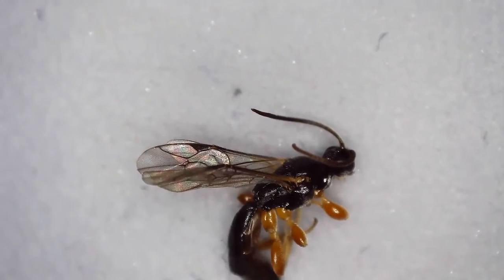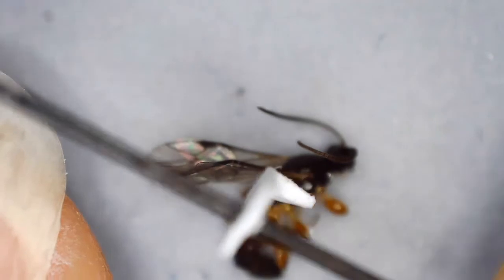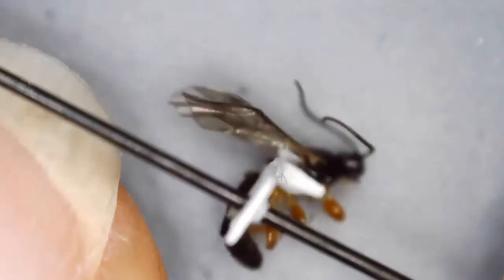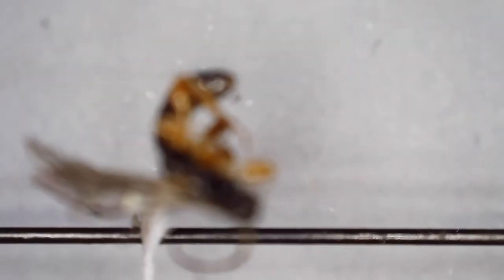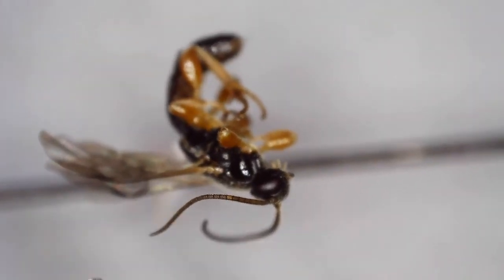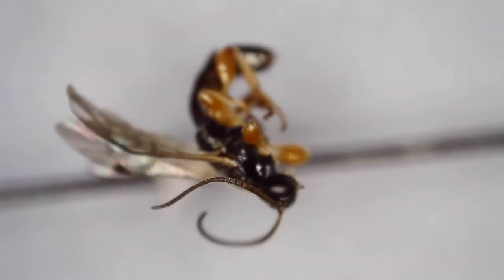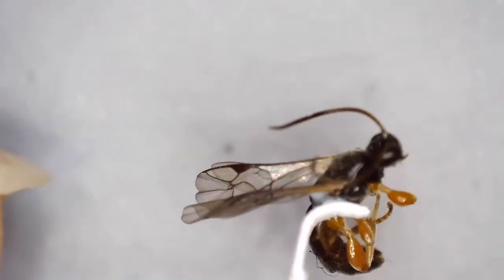So now I'm going to try to press my glued tip against that right side of the thorax, just right there. So once you have the insect, since that glue is going to take a couple minutes to dry, you can do some amount of manipulation to get it more straight on that shelf, or to move some features out of the way. But as you can see, it's sort of a tricky proposition here that you can only move it so much without accidentally knocking it off of its shelf.